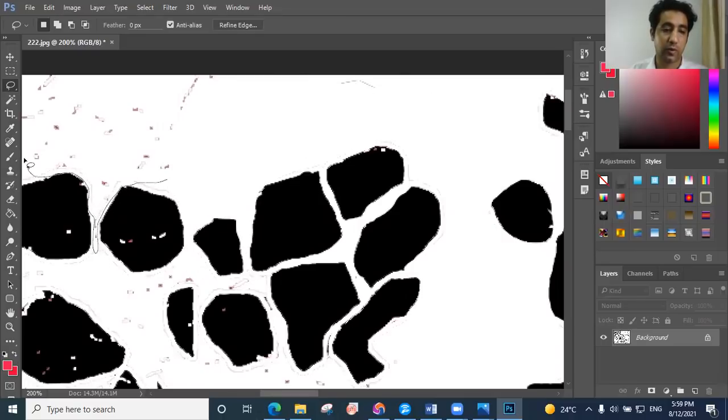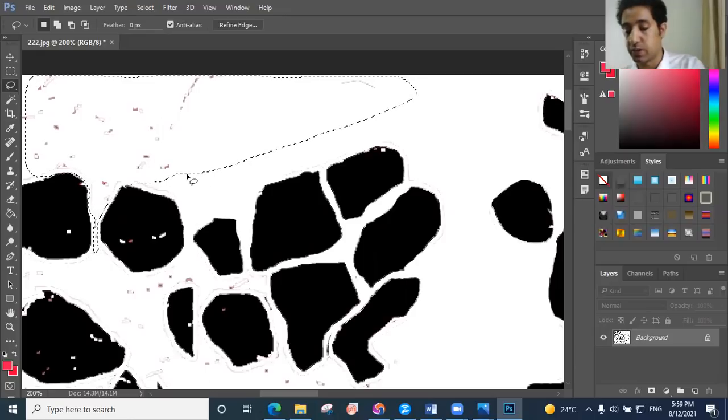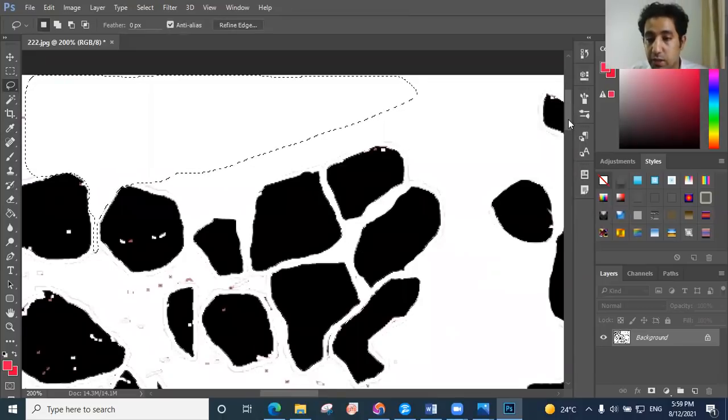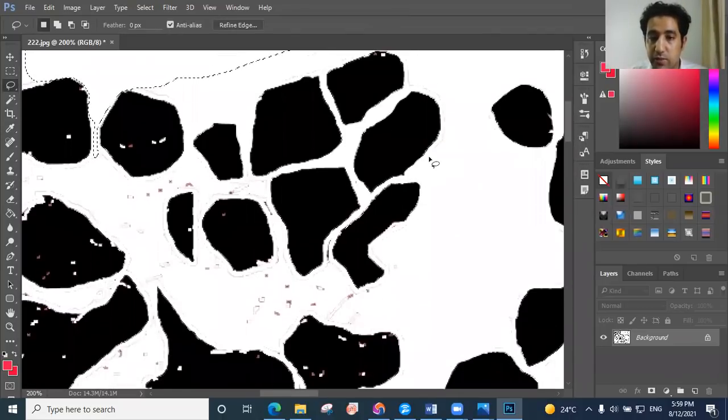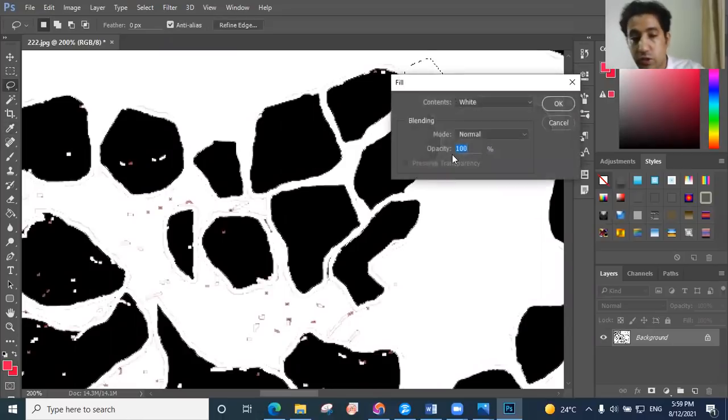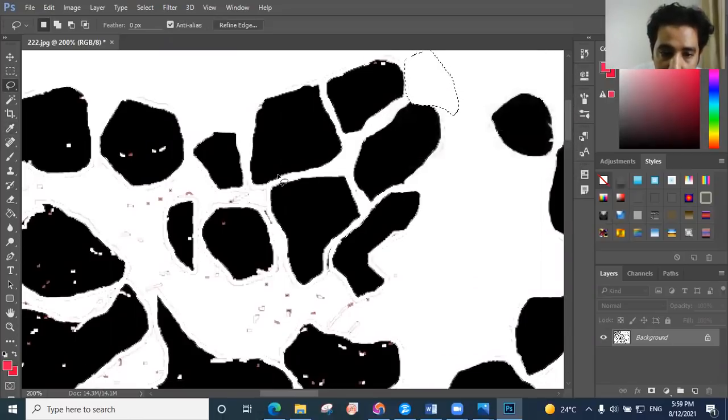So any problem of using this method can be solved. Just be patient. I show you this method and I chose a colorful image to show you how to solve any problem you will face when you are calculating the grain size.